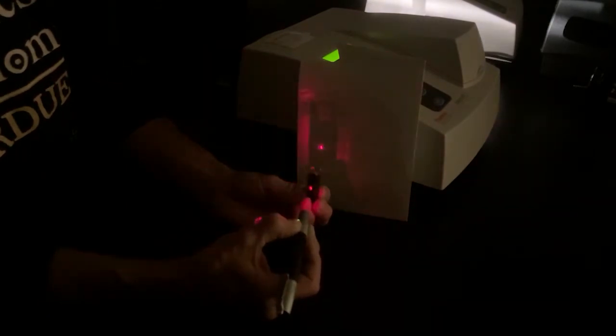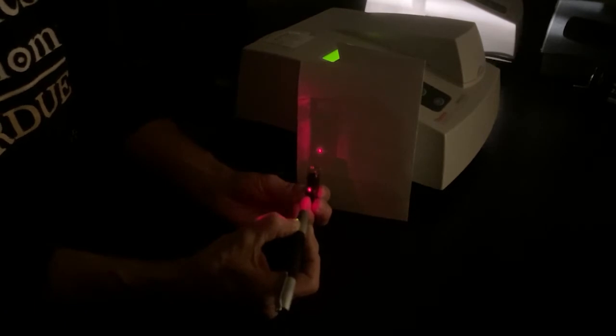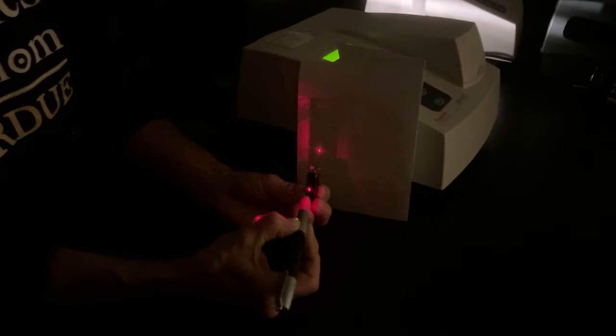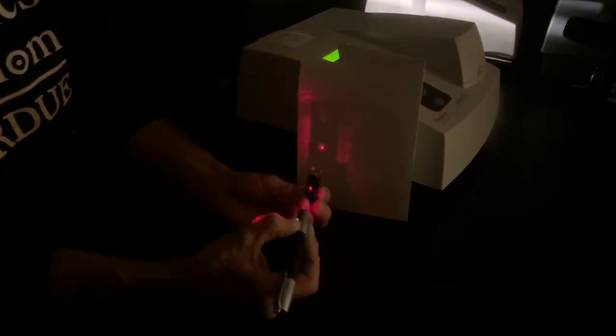And we can analyze the presence of each one based on the amount of light that it absorbs. The amount of light that it blocks. Because the stronger the solution, the more light it blocks, the stronger the solution, the more we know is present. So, it would be more concentrated? It would be more concentrated. Good word.